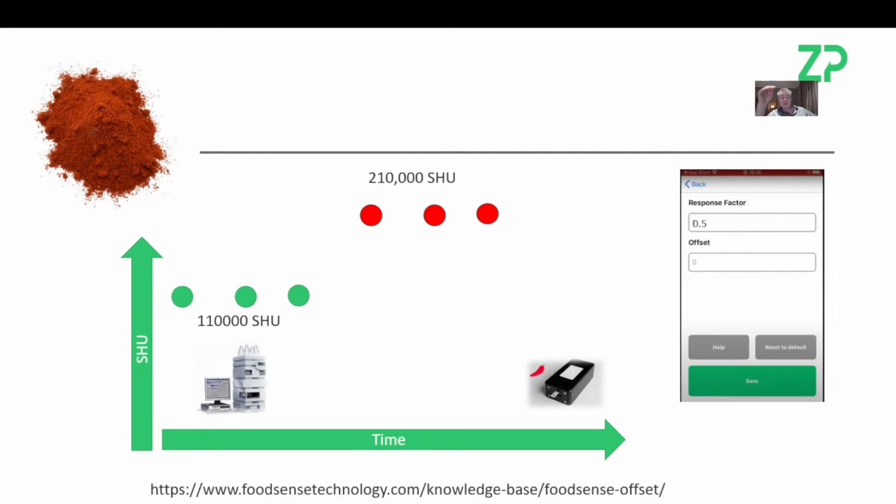What we're trying to do is address that people have an expectation that the HPLC is correct. HPLC is not necessarily correct. You see people report, for example, numbers on those certificates of analysis with no error on that, and their error could be like plus or minus 30%, which it really could be, and they're not reporting that.